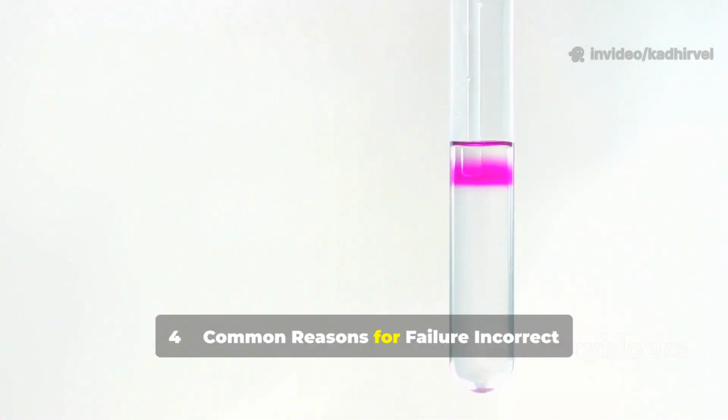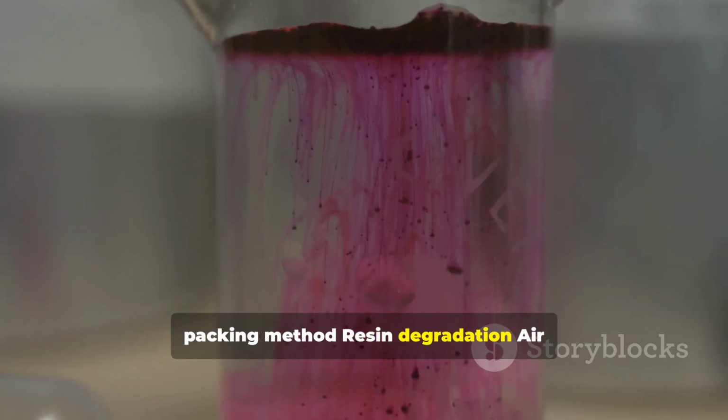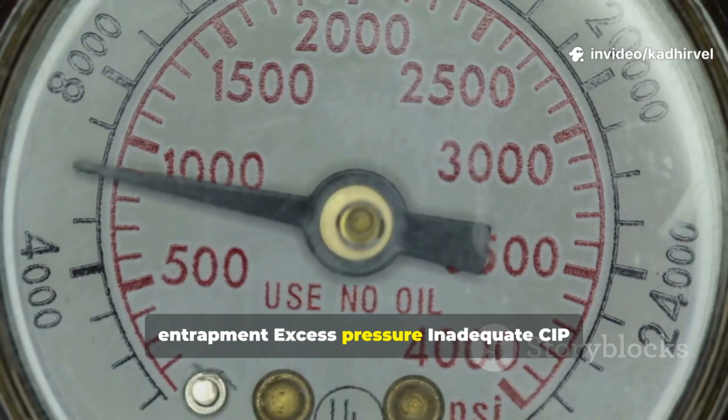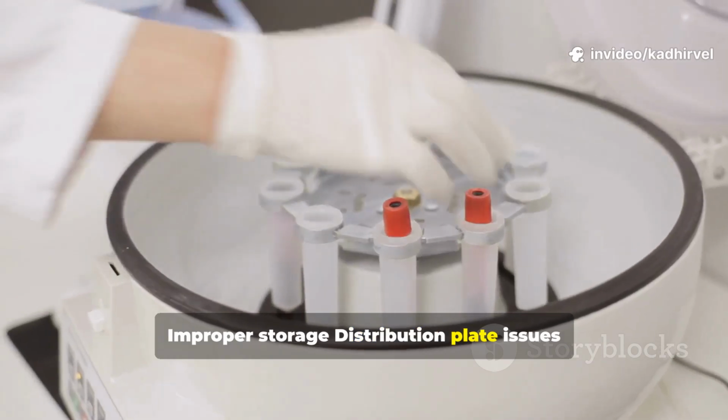Common reasons for failure: incorrect packing method, resin degradation, air entrapment, excess pressure, inadequate CIP, improper storage, and distribution plate issues.